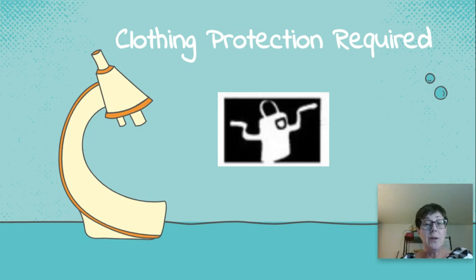Clothing protection required. This is an apron. Most of our labs will not require our clothes to be protected, but if we do, I have those available for us, and I'll provide them.